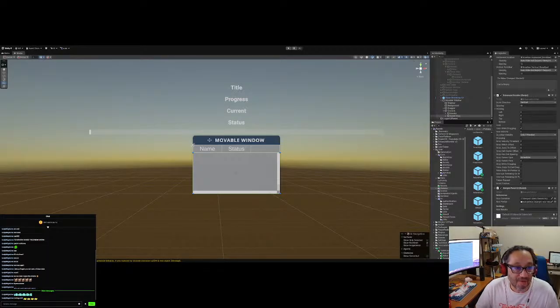All right, and then if everything fails, it'll give you a message, and that message is going to be reflected on the logger service that we had before. We grab the sample data, and then return it. And that's pretty much it, right? So we added another layer to the sample service. We have our database service, our CRUD service, but we still need to feed it queries, or migrations, whatever. And this is Supabase; they call it something else.